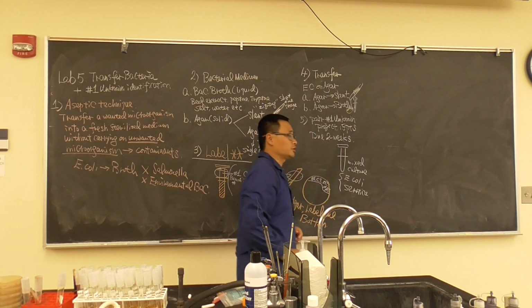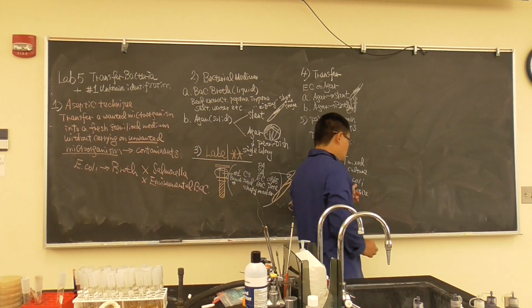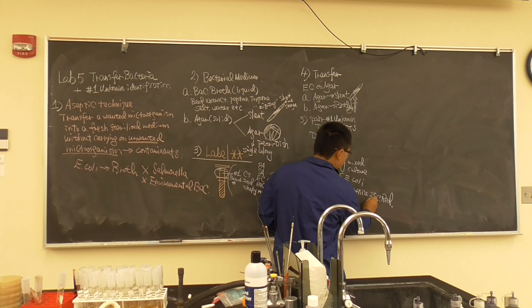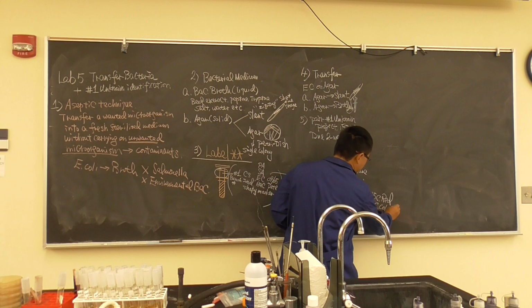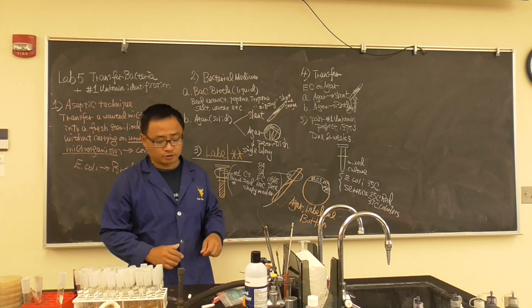It is very interesting and gives very good results. The Serratia grows at 25 degrees Celsius. It is a beautiful red color. At 37 degrees Celsius, it is colorless at the top. And E. coli grows at 35 degrees Celsius. So you can differentiate which one is which.